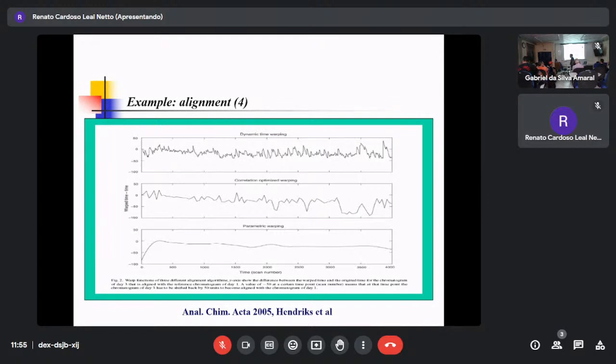Warping, W-A-R-P-I-N-G, means moving each signal independently. Like this one I move here, and this signal moves the other way. Then we need a mathematical algorithm. Calibration doesn't need a mathematical algorithm; everything moves. But in the warping case, you have to do this for each signal.